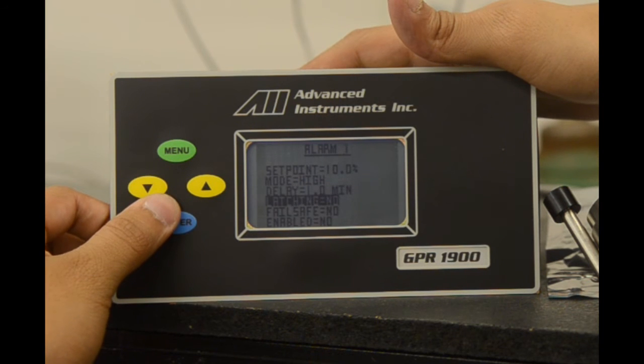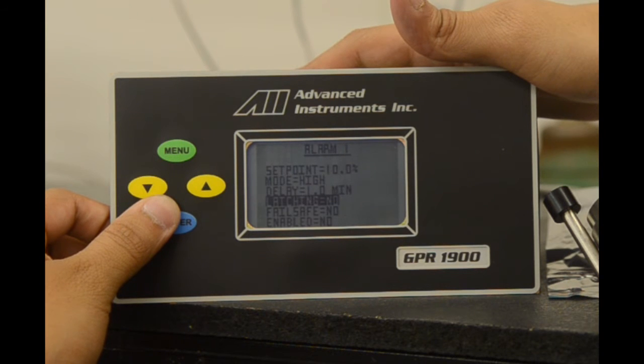We have a latching option, which is currently set as no. Again, enter to enable it. Latching allows the alarms to be in a latching mode where once an alarm set point has been reached, a user will have to physically come to the unit to release the analyzer from its energized position.